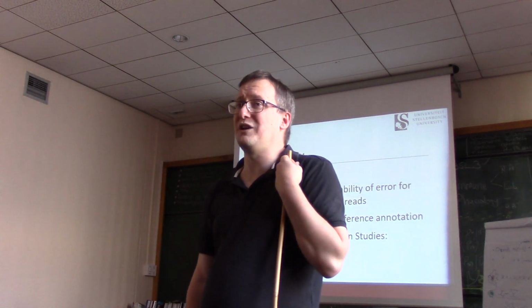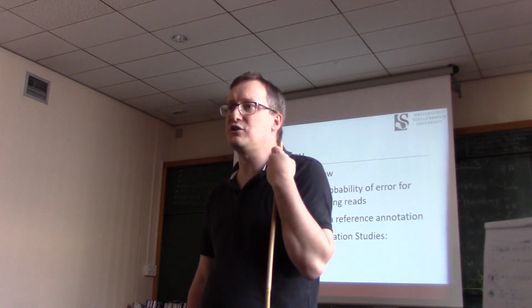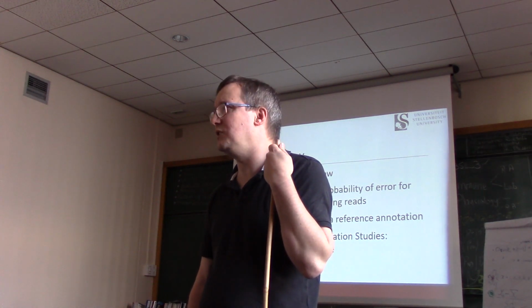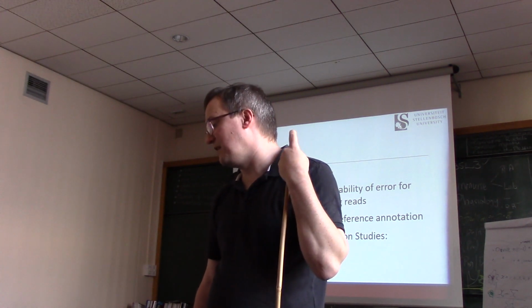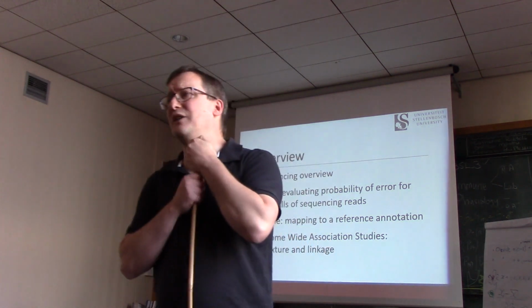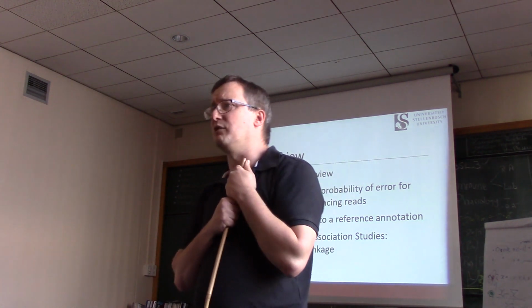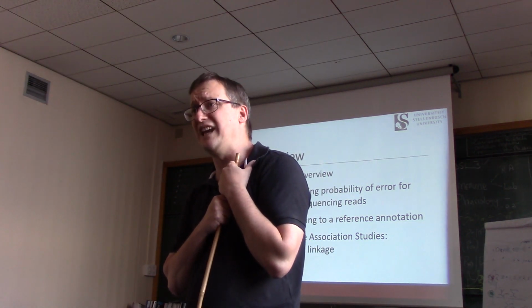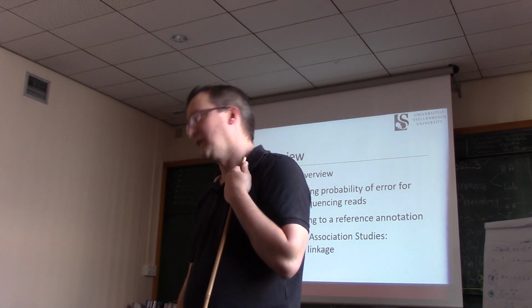From there, we will talk about the fine exercise of mapping, one of 2 major bioinformatics exercises that we use in the space of next-gen sequencing. So we'll be discussing Bowtie as a result. And then from there, we will talk about GWAS, or Genome-Wide Association Studies, particularly with relationships to the terms of linkage and admixture, a bit of stratification as well.